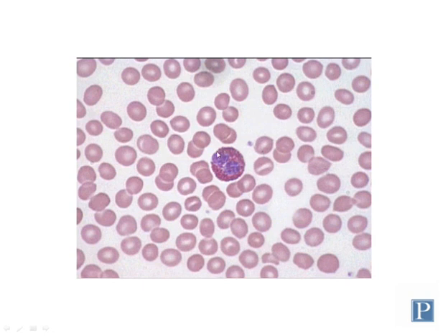Another distinguishing characteristic of eosinophils, besides having coarse eosinophilic granules in its cytoplasm, is they have a typically large bilobed nucleus. So here you can see a large basophilic nucleus. It has two large lobes. Here's one here. Here's the other one here, connected by a thin bridge of nucleoplasm, giving it a characteristic kind of barbell or dumbbell shape to it. So the nucleus of eosinophils is usually easy to see and very distinct.